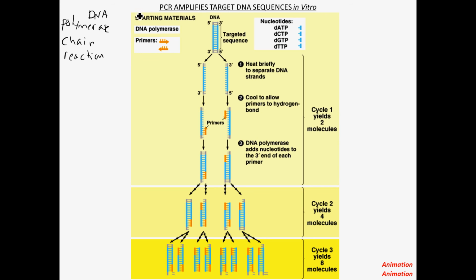So to do the PCR, I will back up a second. What is the purpose of PCR? The purpose of PCR, as the title implies, is that it amplifies target sequence DNA, right? So by amplify, we mean that the PCR is a way to make many copies of a specific DNA sequence, right? Amplifying. Another way that you also might hear this referred to is that you are cloning, making lots and lots of copies of the exact same sequence. That is the whole point of PCR.